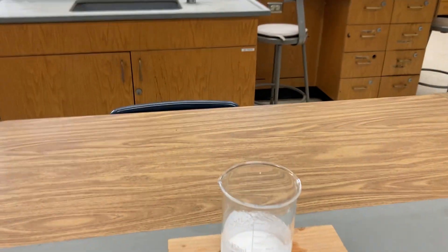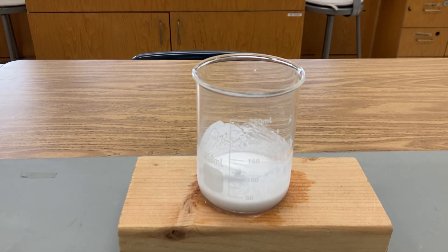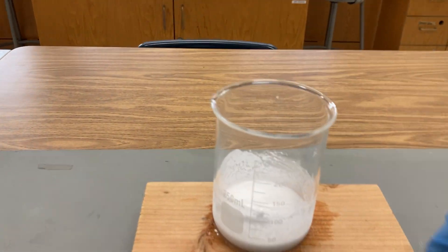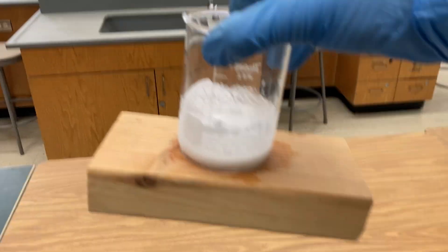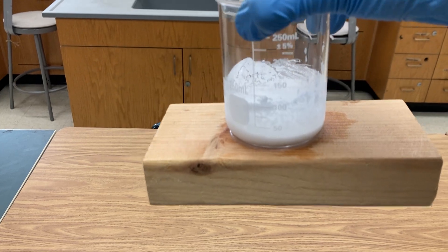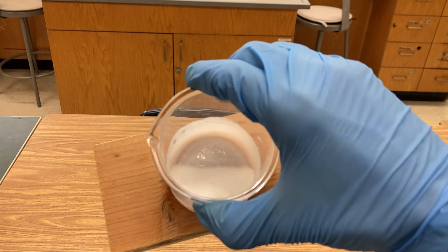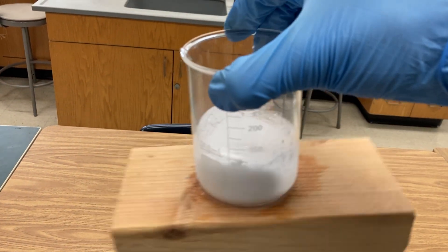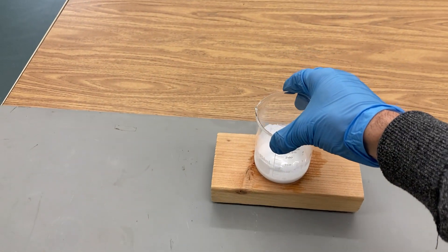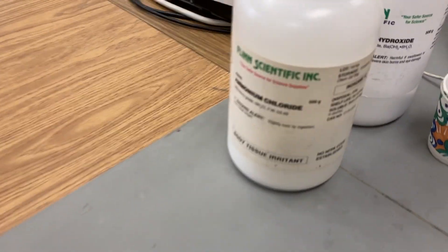This reaction was very what we call endothermic. The wooden board, which weighs a lot, has actually frozen solid to the beaker. Remember we put a little bit of water underneath it, and it was so endothermic — the beaker pulled in so much heat from the surroundings — that the liquid water froze solid. This has been the reaction of ammonium chloride and barium hydroxide.